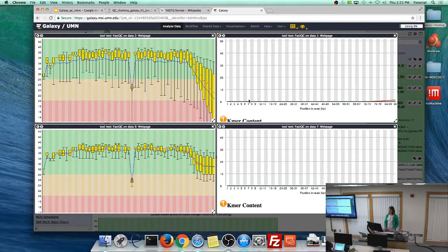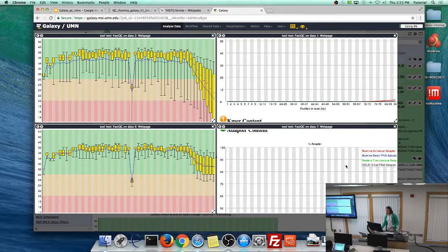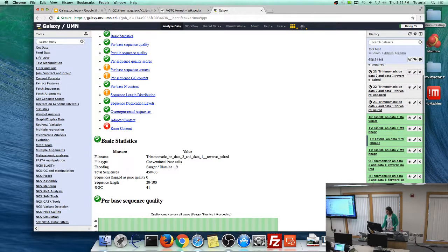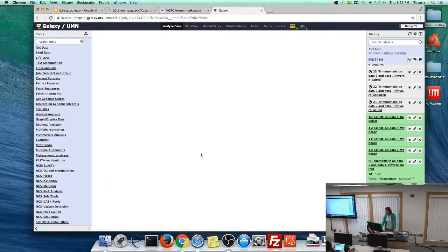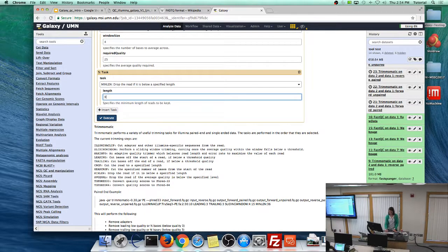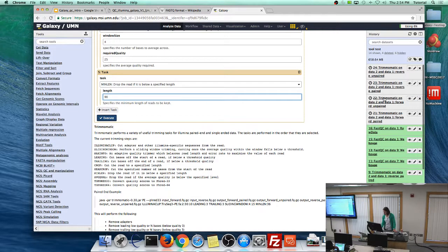One major advantage of Galaxy is that you're never writing over your old data. Your original files are always preserved, and every step is saved. If you were too strict with your trimming parameters, just click the recycle icon on the Trimmomatic result, it restores your original inputs, change your minimum length from 20 to 90, and run again. Everything is reproducible and adjustable.